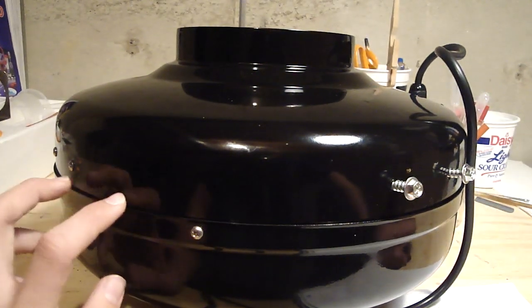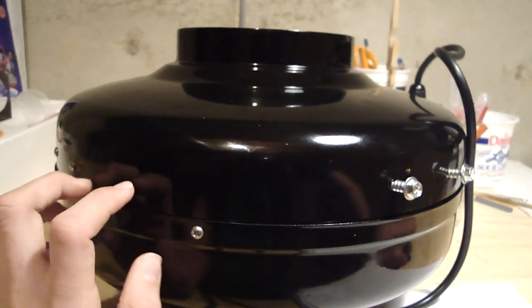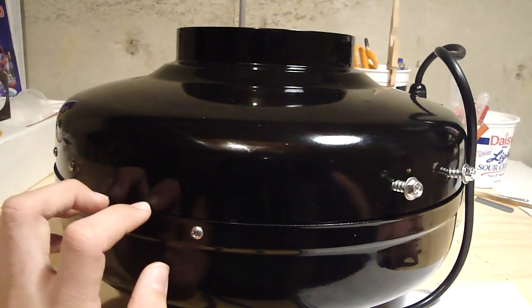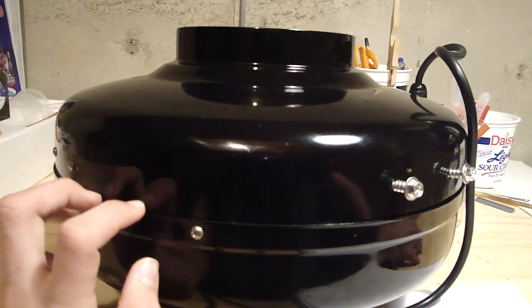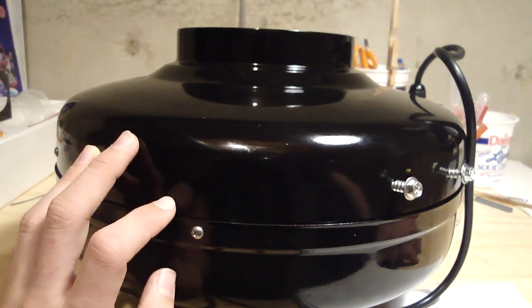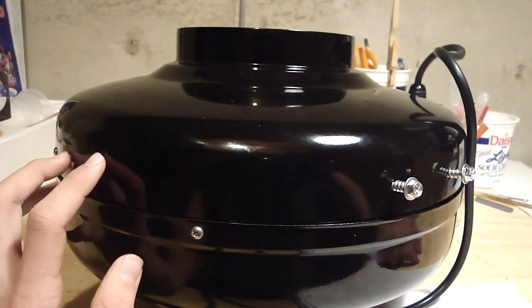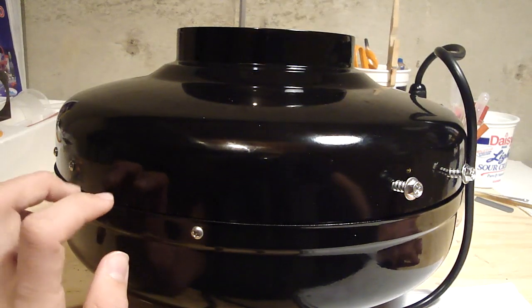If you're looking for a cheaper option, you could possibly use a duct booster fan — the kind used when a room is too cold and the furnace air isn't reaching it enough. I'm not sure if that would work though. For this fume hood design I'd say no lower than 250 CFM; you'd get out of the safe range if you go below that. I'd say 300 to be safe. Getting a variable speed with your centrifugal fan is a really good idea because then you can choose the right speed for your experiment.